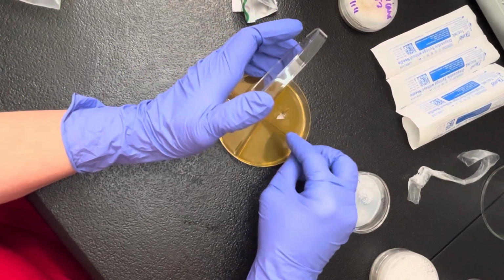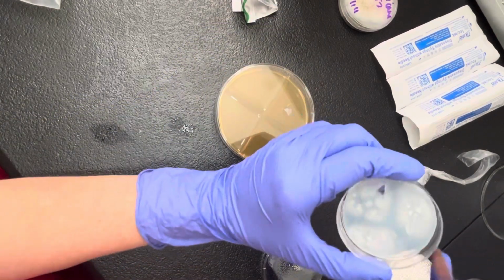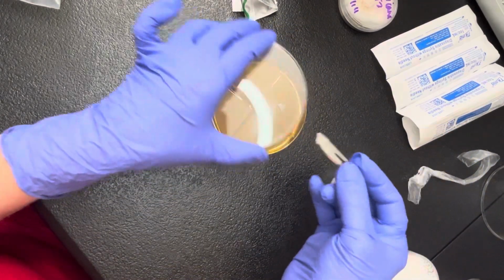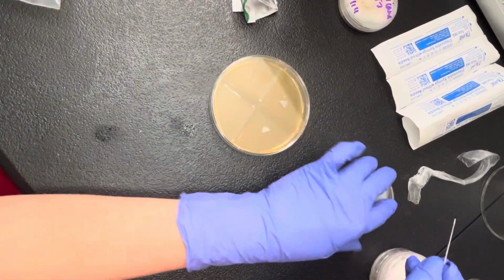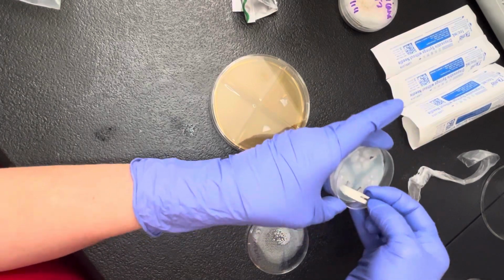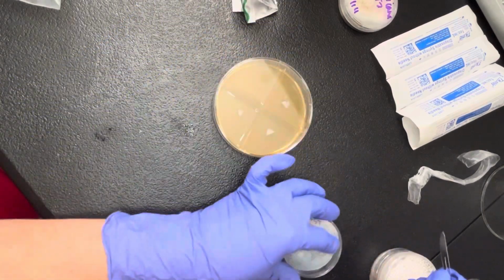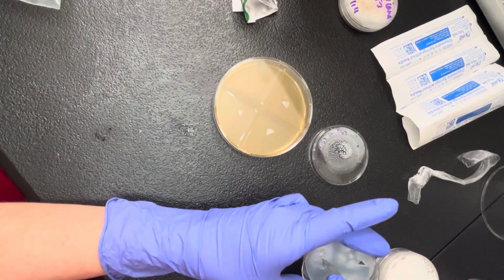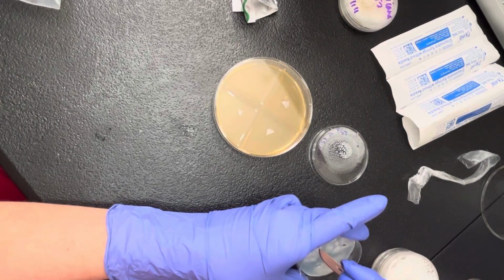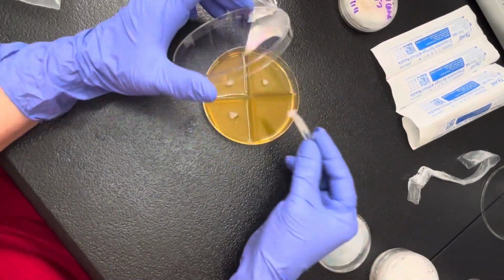That is not wanting to go in there. I very rarely use a blade on my scalpel. I have small hands, I don't really need to. Try not to cross your hand over the plate. I know I'm not.